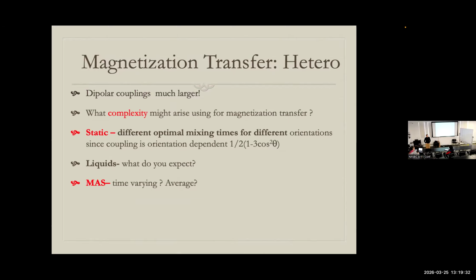For the dipole coupling under magic angle spinning, I've been reading some of Malcolm's papers over again, papers I read a long time ago, beautiful papers, but every time he shows it for the specific case that you actually set the angle correctly. I was told once that David Neuhauser and Malcolm Levitt had a big argument over whether you could have a phase-sensitive NOESY spectrum.